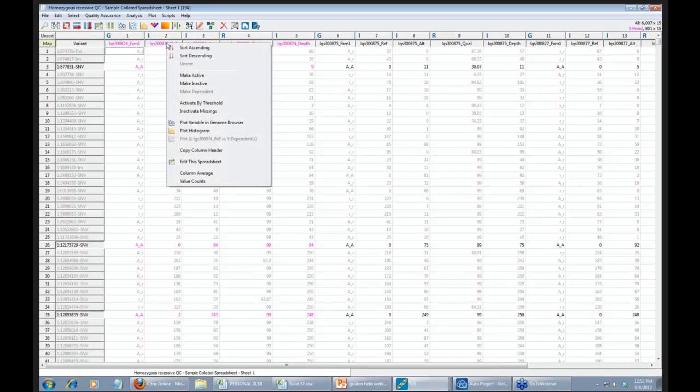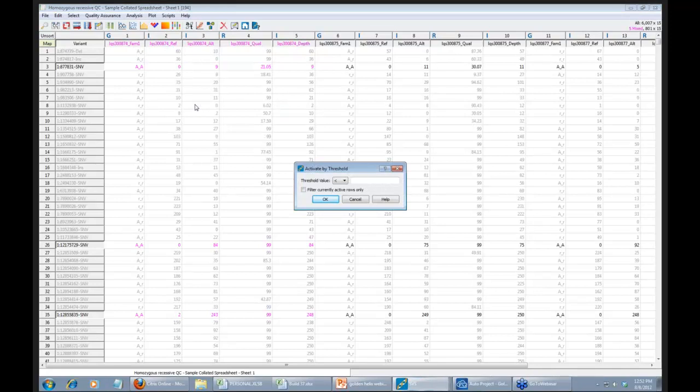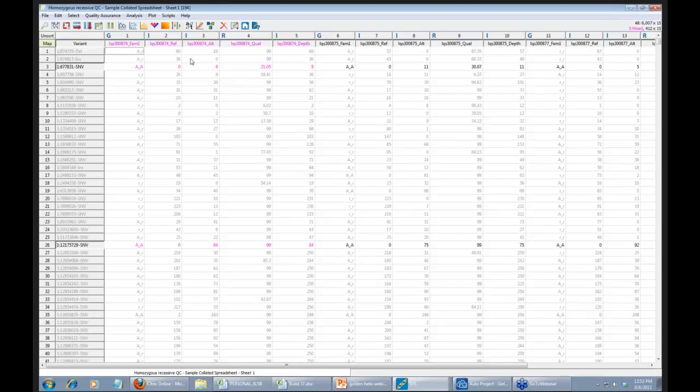In this case, we could go ahead and filter based on the reference allele. Since they're going to be homozygous for the alternate allele, then we can get rid of anything that has that reference allele in it. And so in this case here, I'm going to use a filter of less than 2, so that only the polymorphisms that have 0 or 1 reference allele will be counted. That takes us down to 412 polymorphisms.